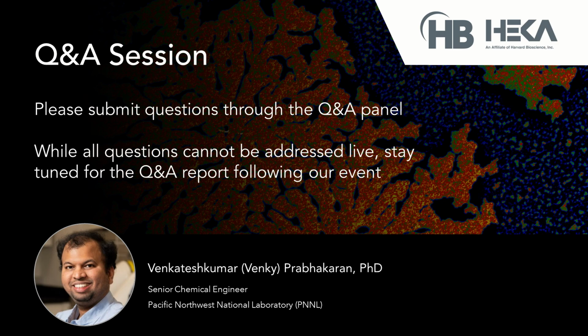And I think the second question is about SECCM impedance spectroscopy. It is also very sensitive to the tip diameter, because the tip diameter also acts as another element in the impedance. That is one of the reasons why, if you use a small tip diameter, your impedance values are usually higher. We also optimized a little bit on that end, and typically found that if you use a 5 to 10 micron tip, you would get a reasonable trend in the EIS response, and also minimize the salt evaporation rate.